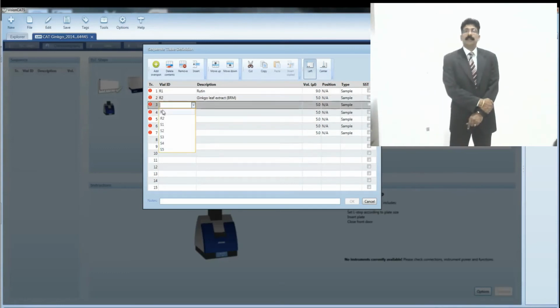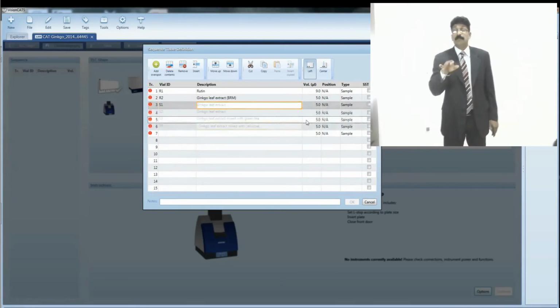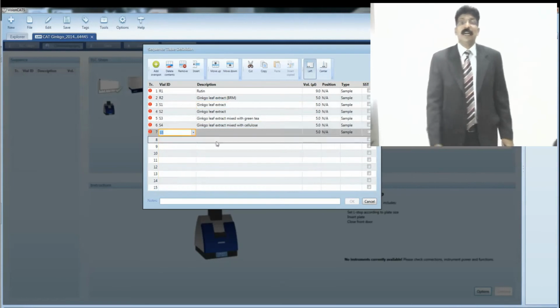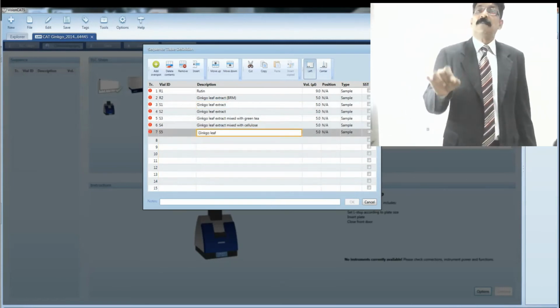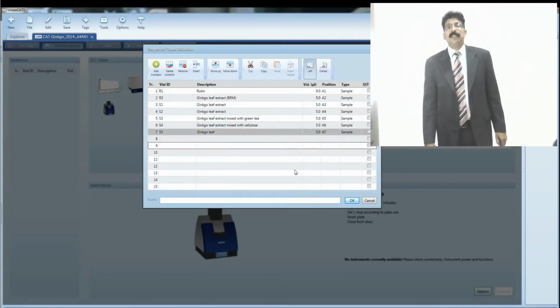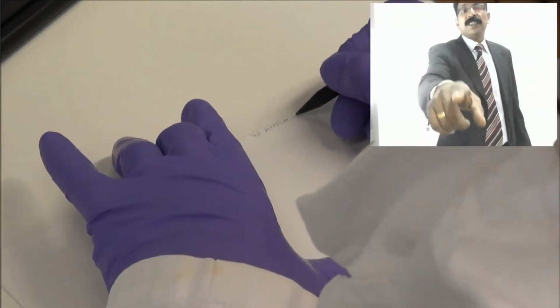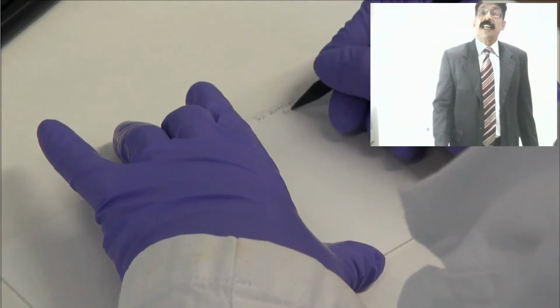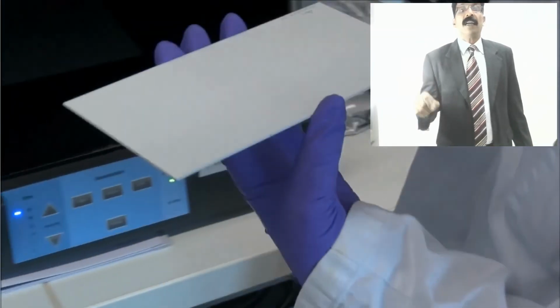Now if you see, this is the instrument she was feeding. Documentation and the sampling feeding are very important: for ginkgo biloba, how many samples, how many spots should be mentioned. All these things she will give in detail. And once she gives the label to the plate, you see there is a ready-made plate, she is writing the date, the name of the researcher or worker, the sample, and the date and time, and she is now keeping it to visualize the plate.